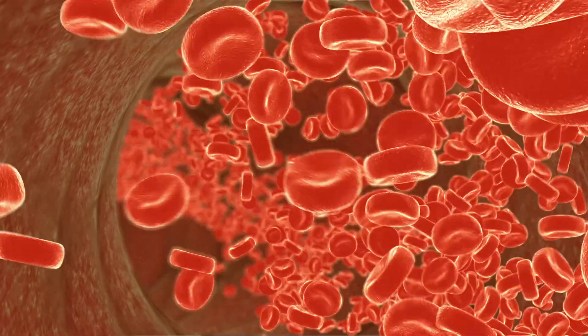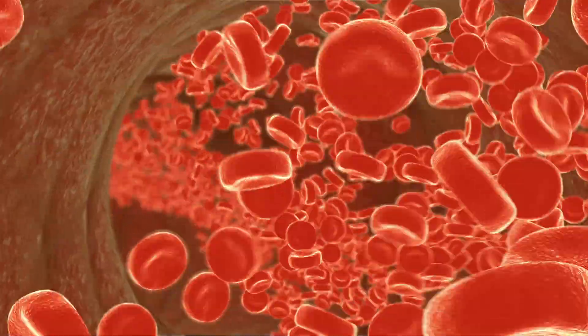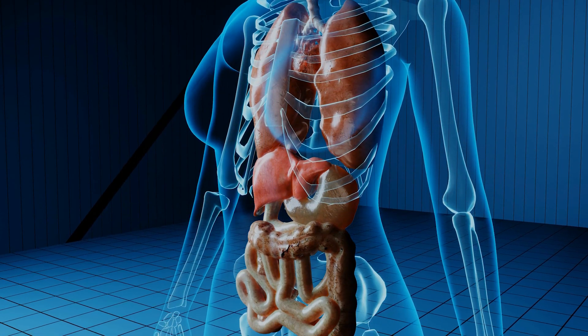Red blood cells are responsible for transporting oxygen from your lungs to the rest of the body.